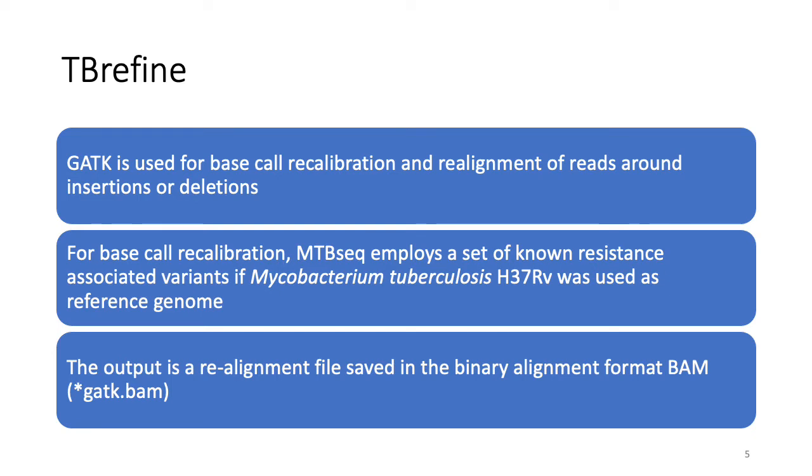or into the indel region with many mismatches. The local realignment tool, in this case GATK, can use information from the other reads mapping to a region containing an indel, including reads that are located more centered across the indel and thus have been mapped with ends on either side of the indel. As a result, an alternative mapping as good as or better than the original can be generated.